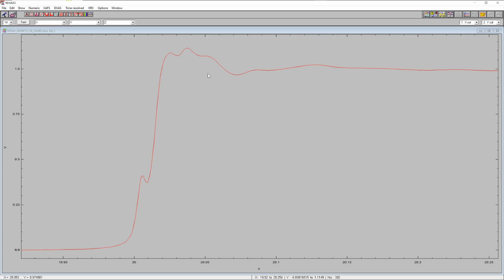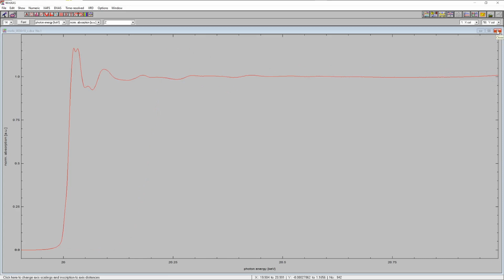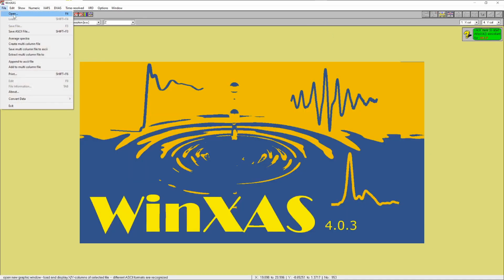So now for the principal component analysis and also for the LC XANES fit, we need some references. And we have raw data files for the references, and so now we are going to create the appropriate reference files using basically the same macros that we just used for the data reduction of this set of spectra to this point. So I'm going to open, and now we exceed the number of open windows. So that can happen when you just go from one file to the other. So we are going to close all the files that we do not need anymore and start again.